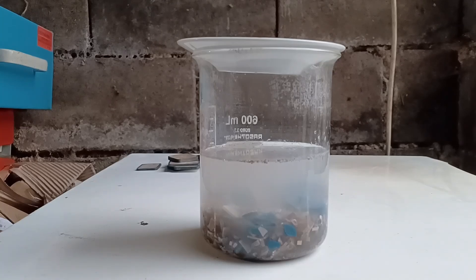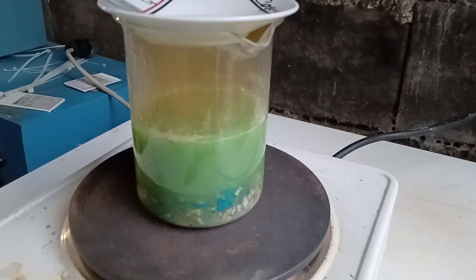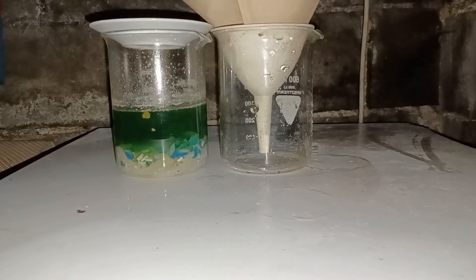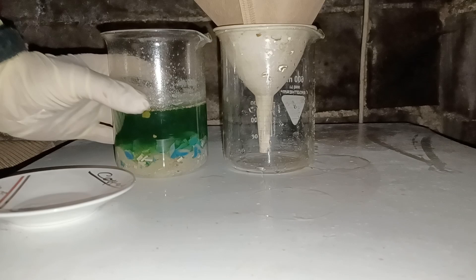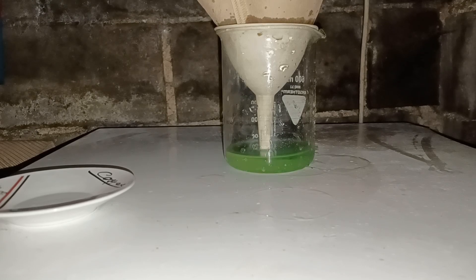If you wish to speed up the reaction, you can heat it up, but beware of increased gas production. When all of the metals were dissolved — or at least the overwhelming majority of them — and the capacitors began to fall apart, I filtered the solution.